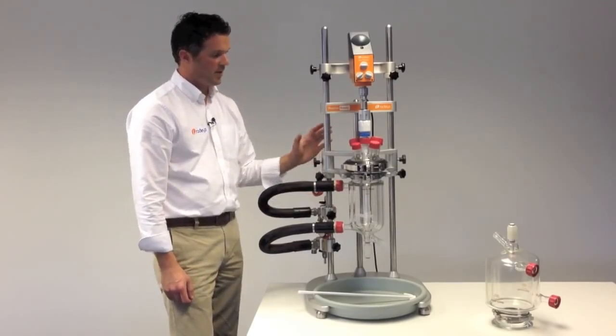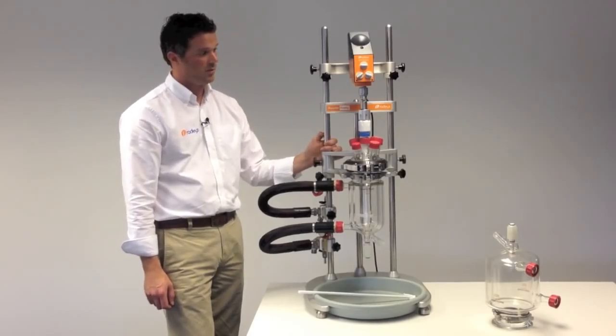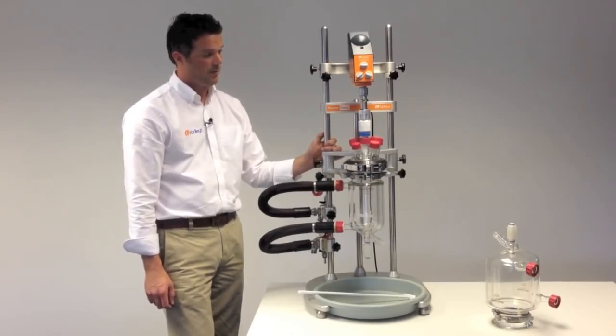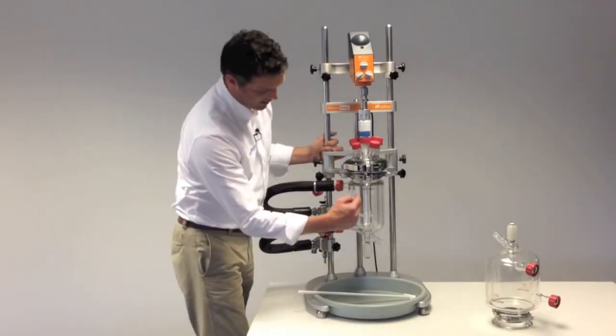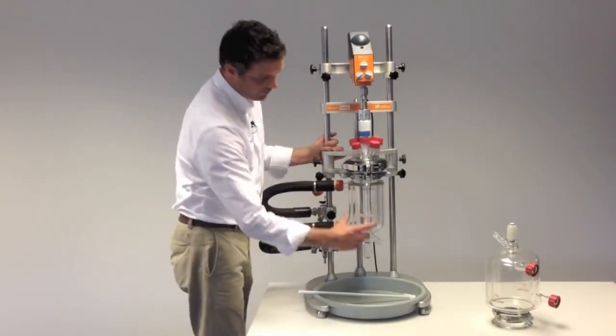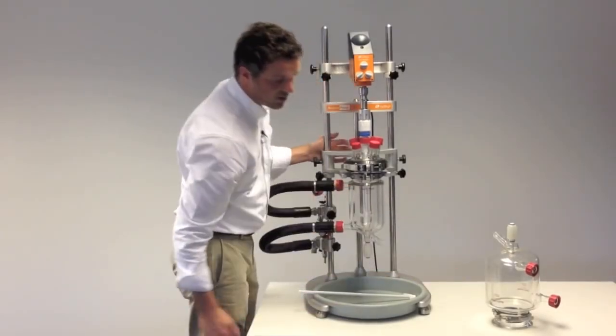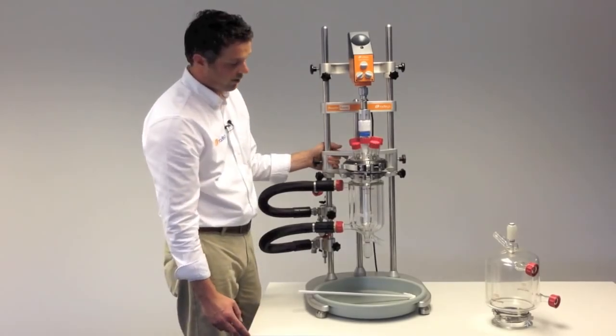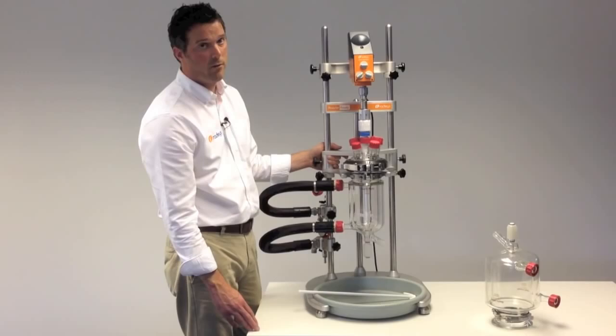This is the standard Reactor Ready framework. This will accept vessels from 100 milliliters up to 5 liters. This is a standard jacketed vessel, and then you can see here we've got the squatter process form vessel. We've also got vacuum jacketed vessels throughout the range.